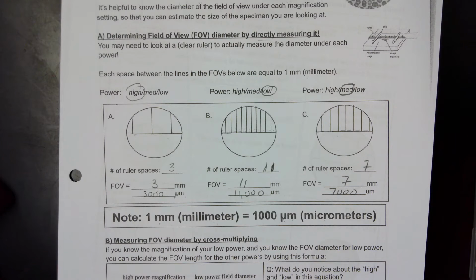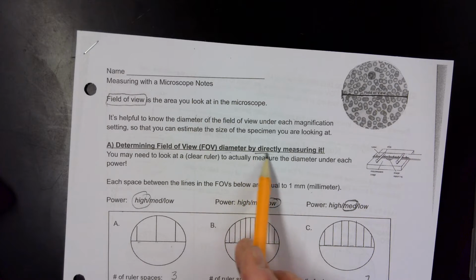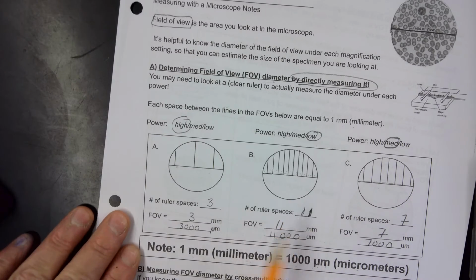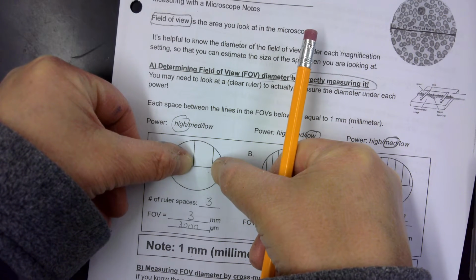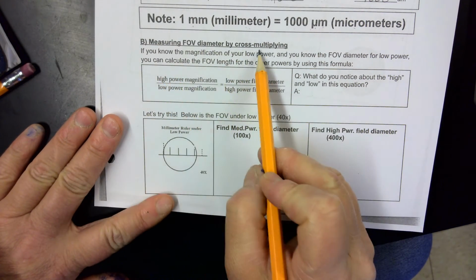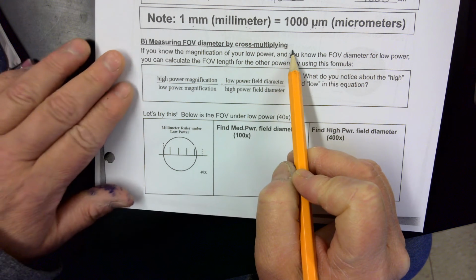So what we have just done is determine the field of view diameter by directly measuring it with a ruler, looking at the ruler through the microscope. Sometimes you're going to find that under high power, you're not even going to see a full millimeter. You might see less than a millimeter, in which case it's really hard to directly measure it. So in this case, we're going to have to use a proportion, which is measuring field of view diameter by cross-multiplying.